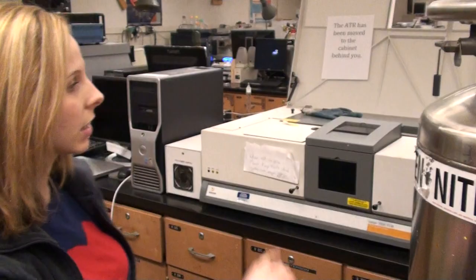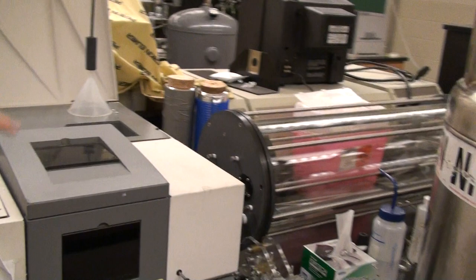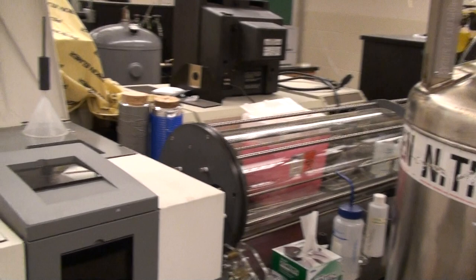Essentially, there's a gas cell down here, and you put your gas sample into this large cell, and it bounces back and forth on these mirrors, and we get basically a chemical makeup of what's in there.